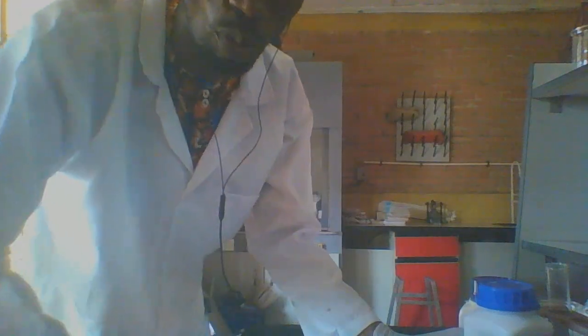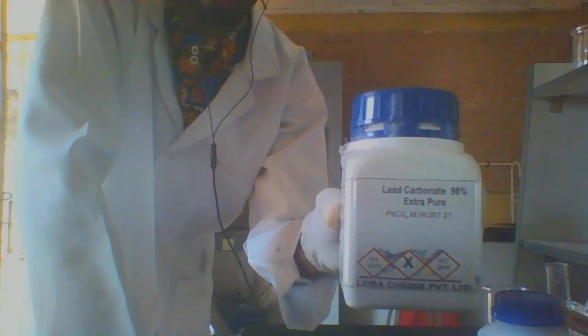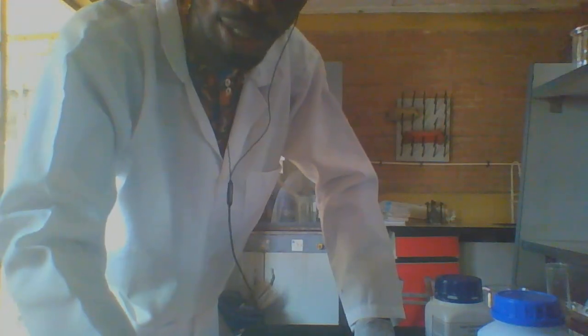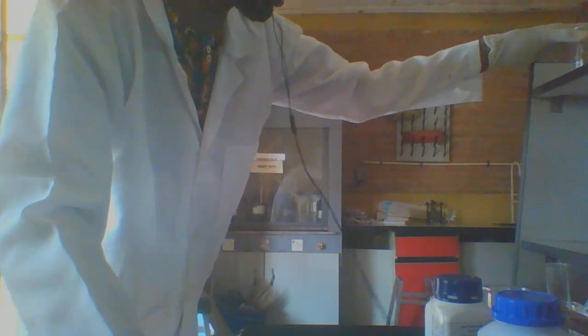Hello, this is Excellential Chemistry, and this is a qualitative analysis of this year's WASSCE, that is 2026 WASSCE. The sample is a mixture of starch and lead(II) trioxocarbonate(IV), that is lead carbonate. You are asked to mix it in a 1:1 ratio, so I've already mixed it here.